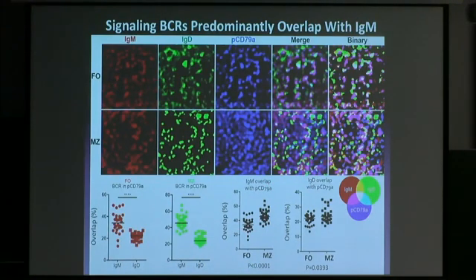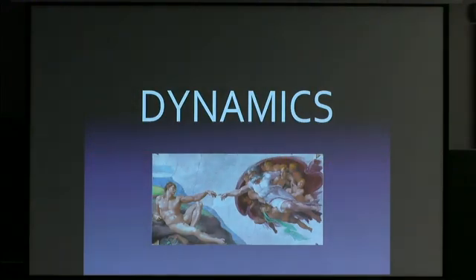So on the follicular cells, there's 30% overlap between red and blue. On the marginal zone cells, there's more, but it's still greater in both cases than the IgD overlap. So again, these receptors, which are not very different, appear to be differentially signaling in unstimulated B cells. Okay.